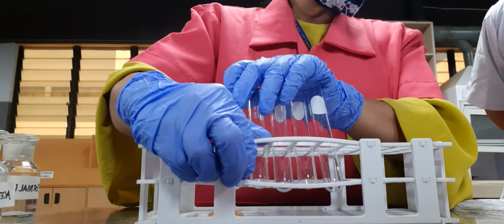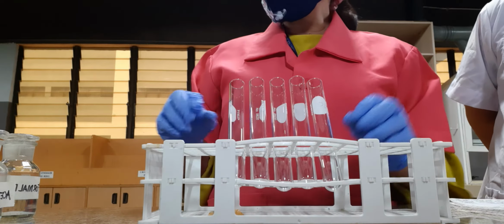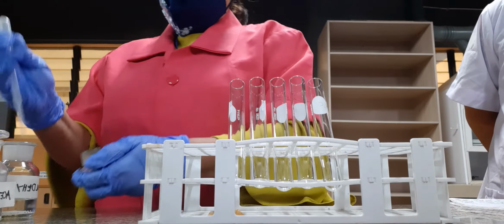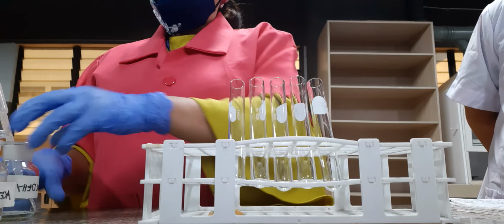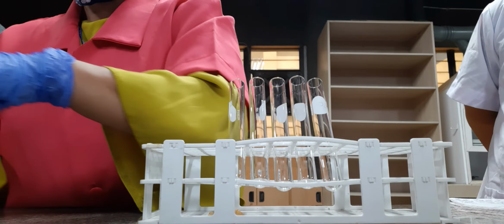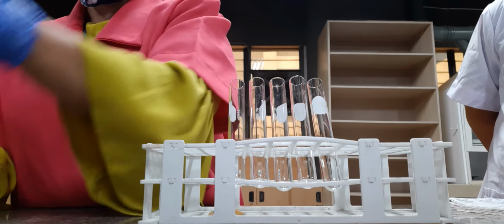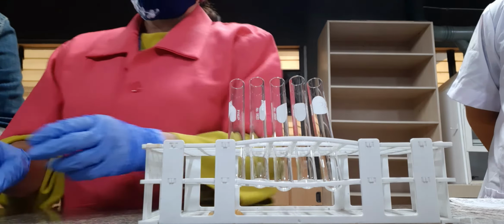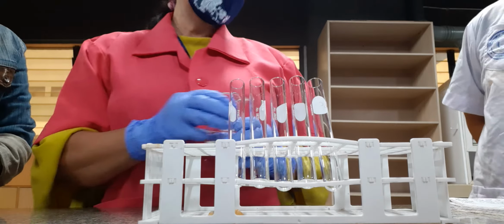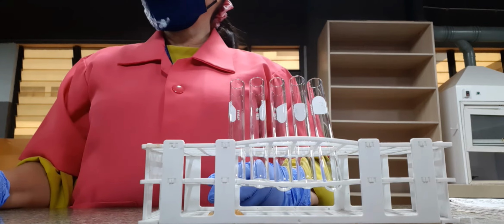1 ml of each of the solutions, and then the same volume of water.